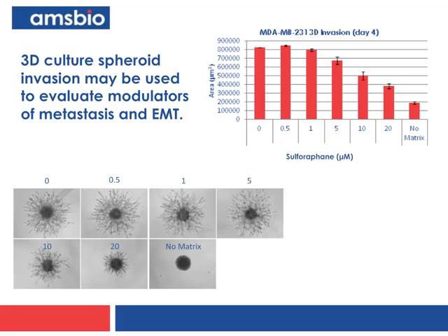Here is a small demonstration of how you would do that. Again, with MDA 231s that give you this pattern without any drug involvement. If we introduce chemotherapy, you can see that this does affect the cells that are invading locally into the matrix, but in fact, you never really reverse back to the spheroid, which is demonstrated here by no invasion matrix. So you're getting already some sense of what processes might be affected by your drug in parallel to each other, rather than running only a proliferation assay or only an invasion assay, as typically is done in cell-based assays.